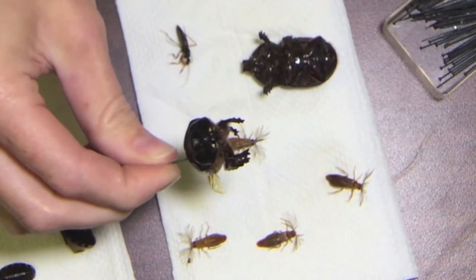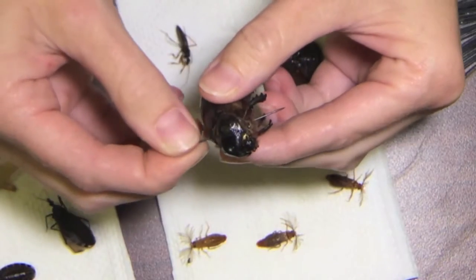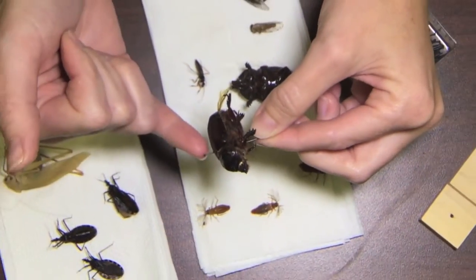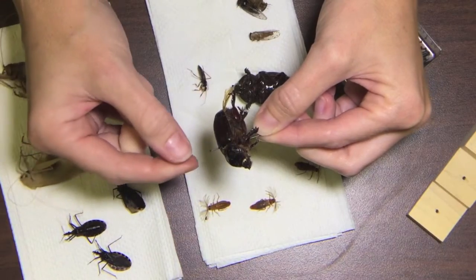This insect is too thick to use a pinning block because he would be shoved all the way to the top of the pin. So what I like to do is stick him on there so that I have enough space to grab — about a pinky width away from the actual insect. You don't want to touch the insect every time you pick up the pin.